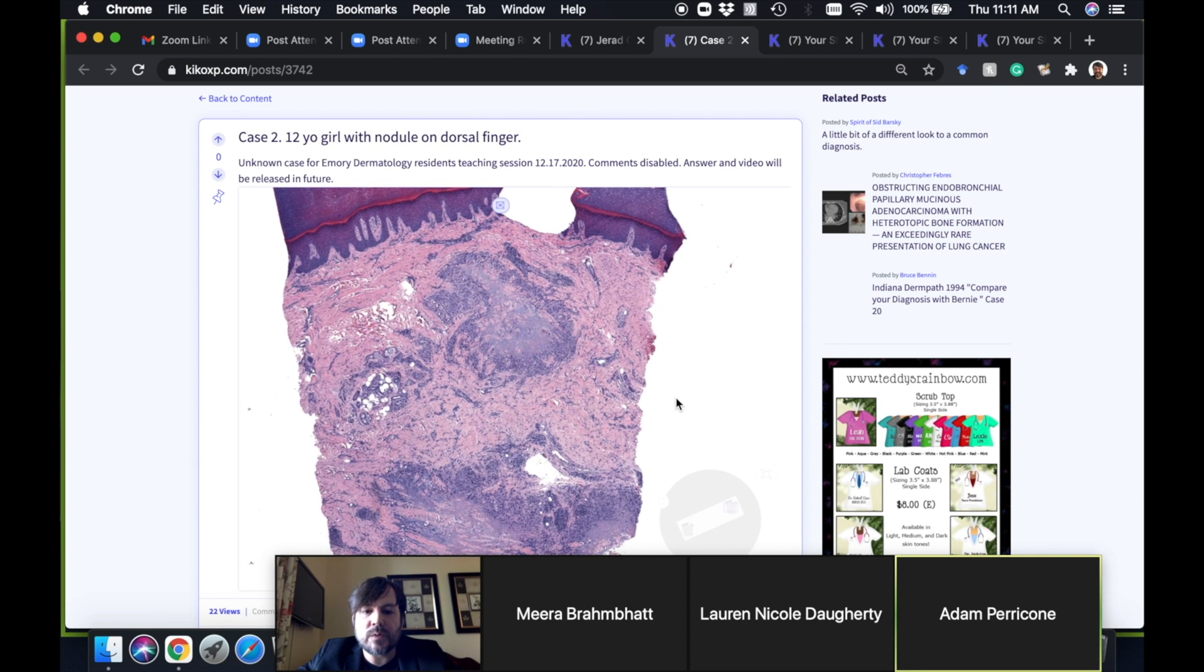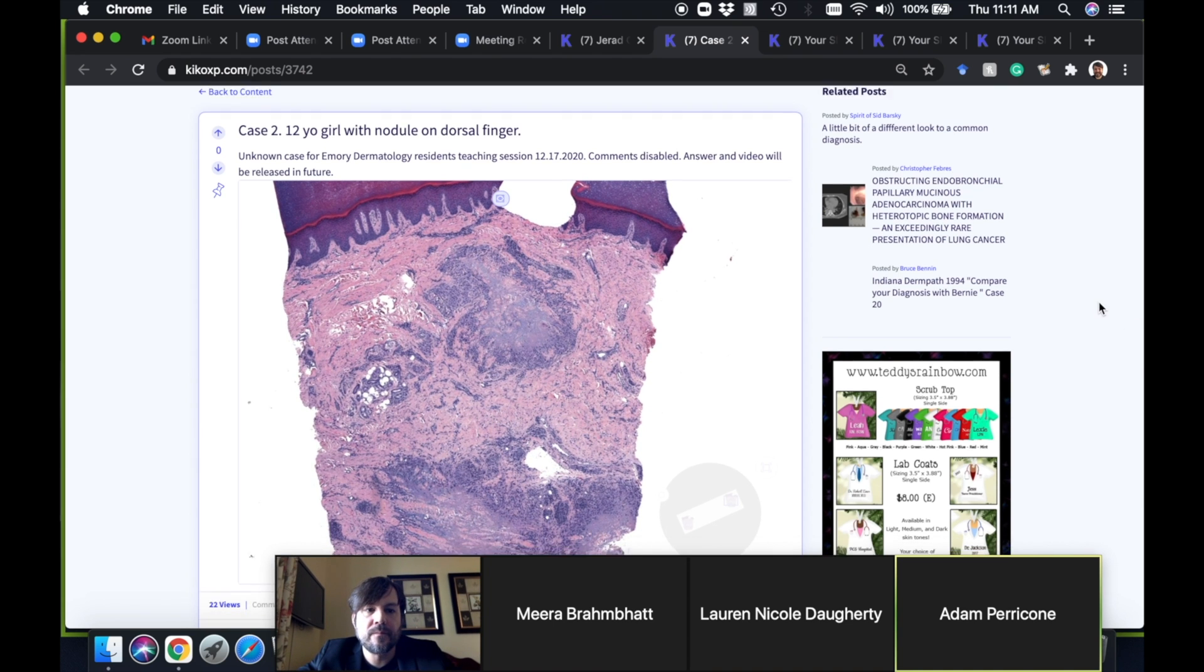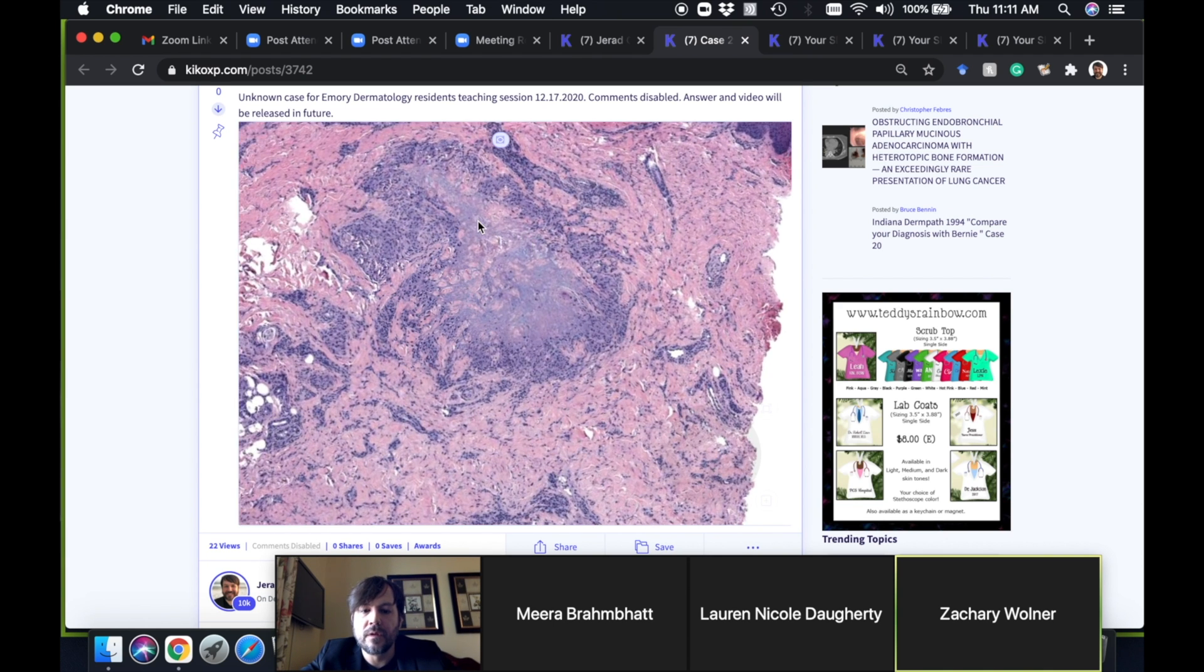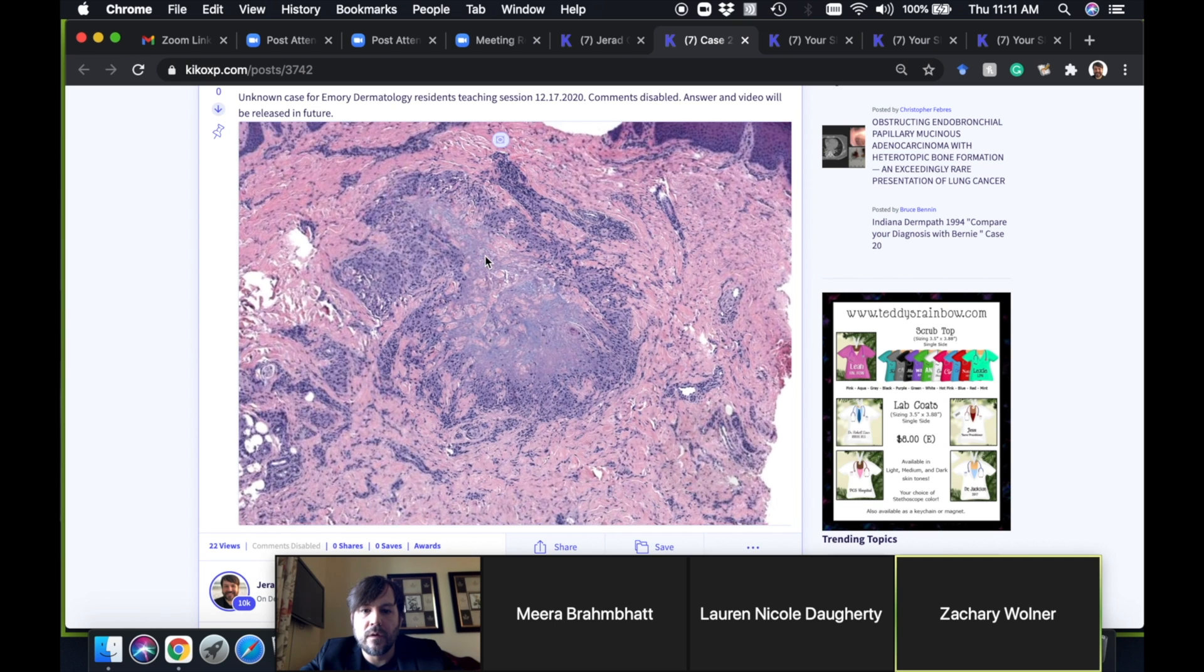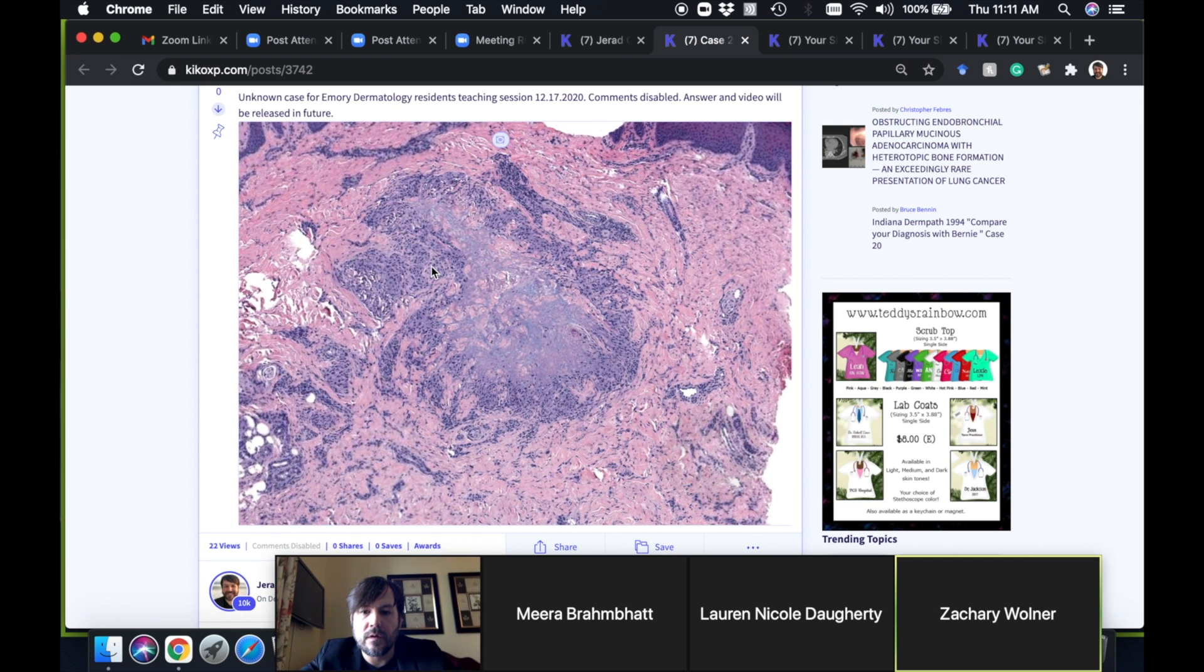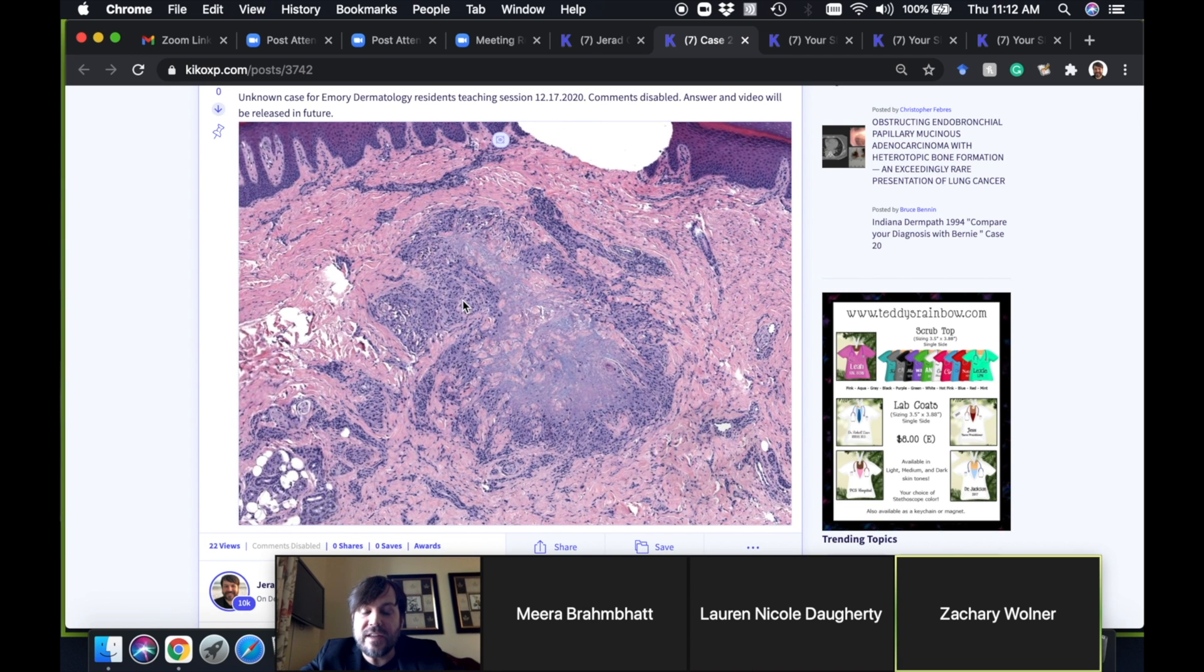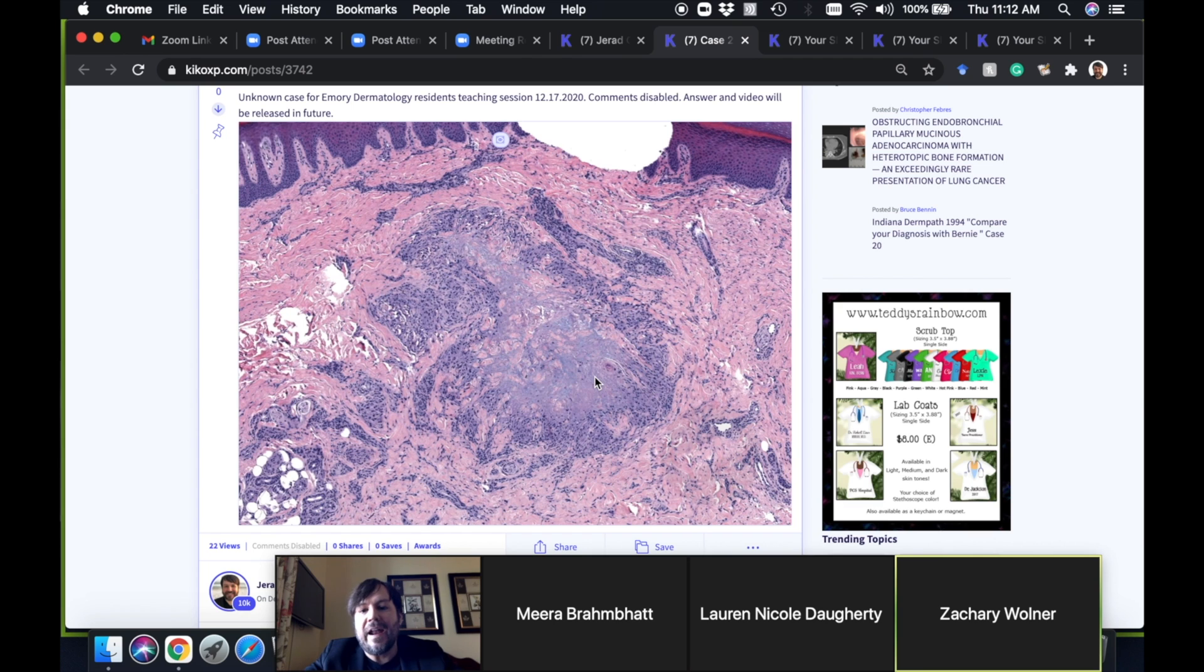I see a palisaded granuloma again but more of a blue center like a granuloma annulare. Very good, yeah this is a perfect example and I like this one because it's so strikingly palisaded just like that rheumatoid nodule.